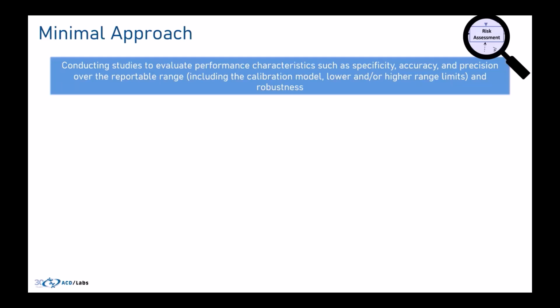So specificity, accuracy, and calibration are generally performed as part of validation, but the guideline does mention that this can be performed prior to validation, and if so, it does not need to be repeated. Validation is outside the scope of AutoChrom, but if you would like to add those experiments to the sequence list, maybe in a pre-validation, you can. The software just doesn't generate it automatically. We also have software that can help you with generation of calibration curve if you wanted. Now, let's focus on the robustness aspect of this.